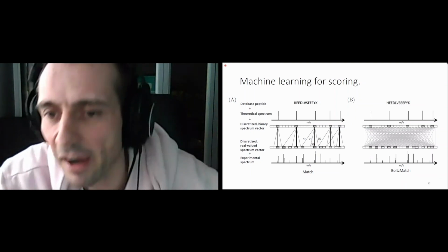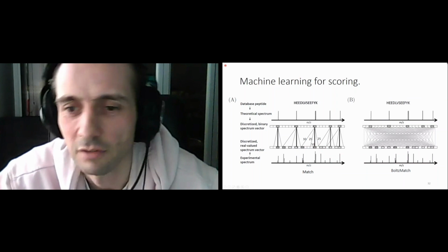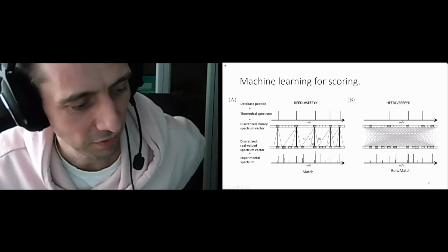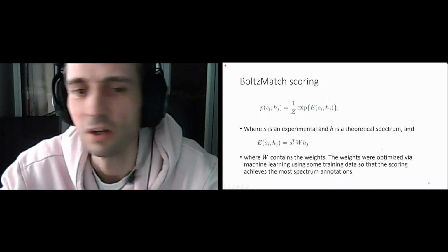But if you have a high resolution instrument, then here you have 100,000 bins, and 100,000 times 100,000, it's a lot, yes. But you can still actually read. The good thing with mass spectrometry, we have plenty of data. That's not an issue.